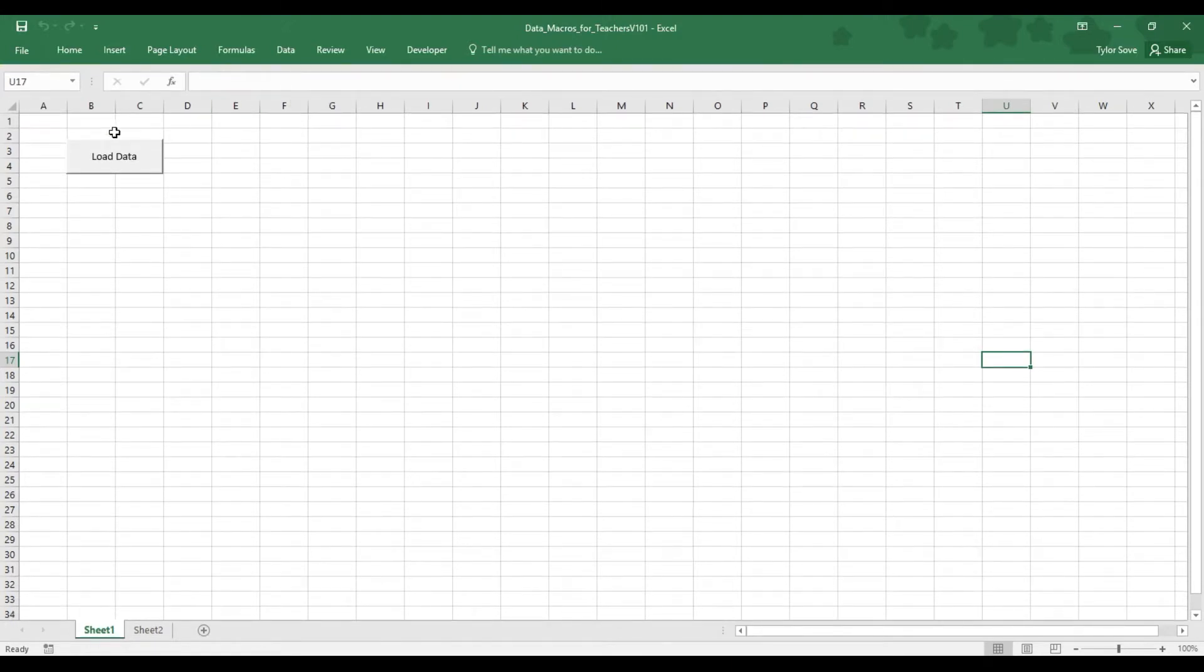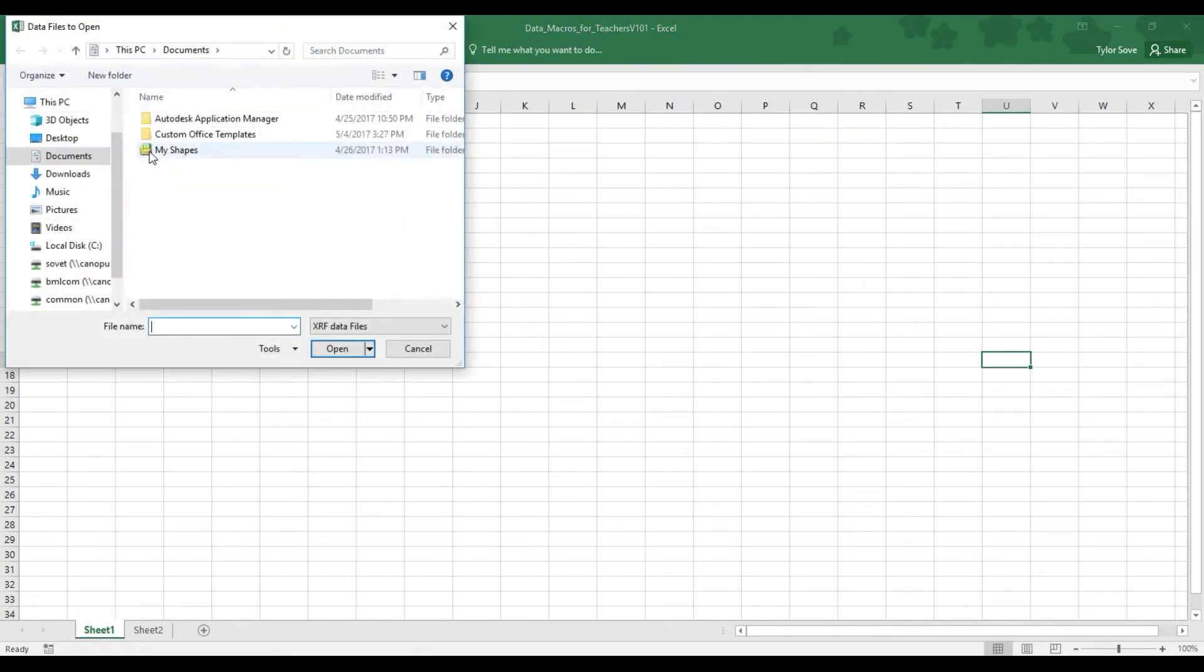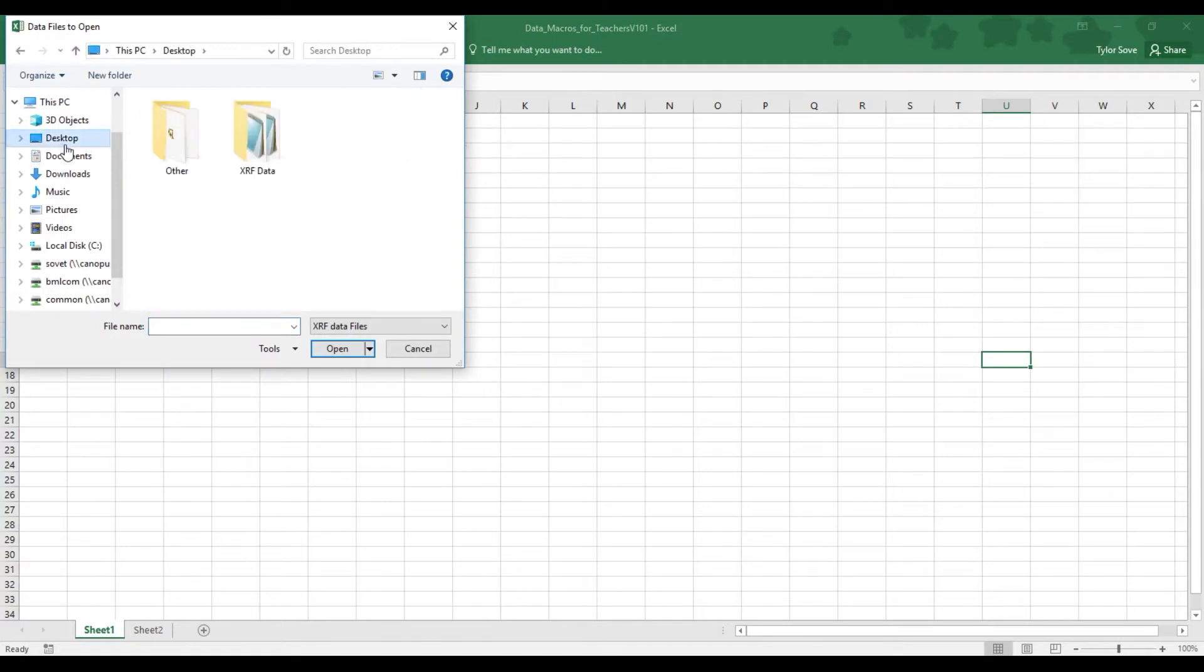Now, go ahead and select the Load Data button, and you will be prompted to go and find your data. So go ahead and do so.